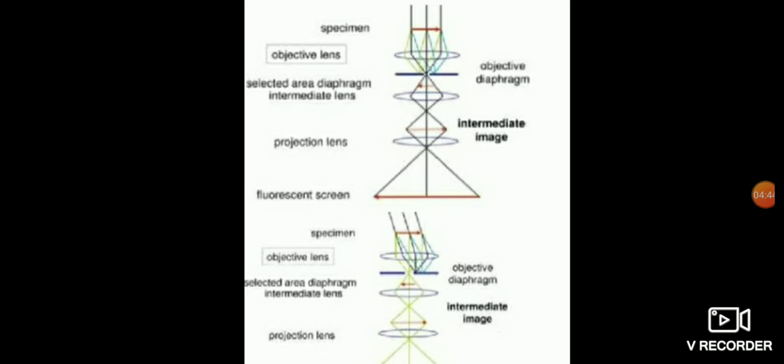The wavelength of high energy electrons is a few thousandths of a nanometer, and the spacing between atoms in a solid is about 100 times larger. The atoms act as a diffraction grating to the electrons, which are diffracted. As a result, the image on the screen of the TEM will be a series of spots or rings.